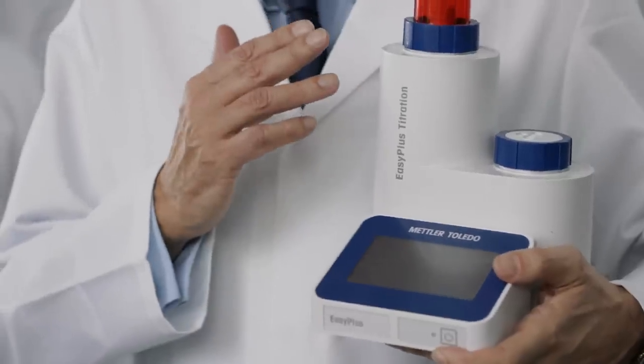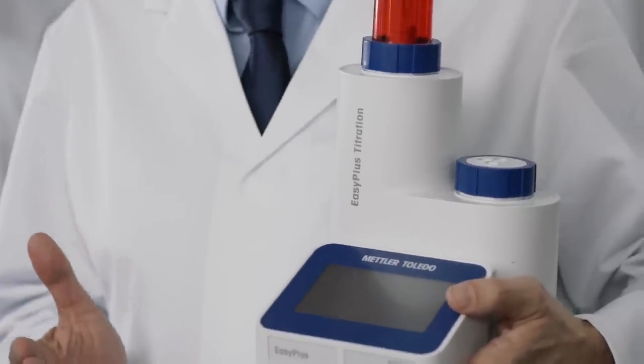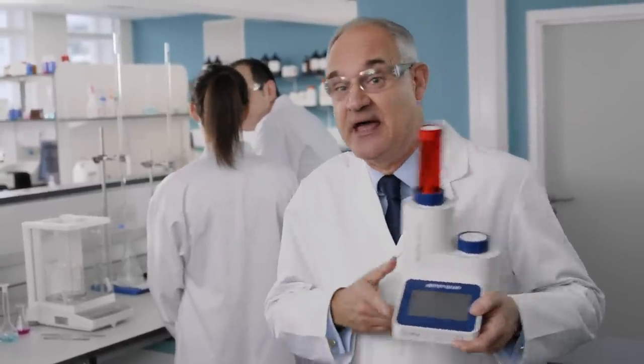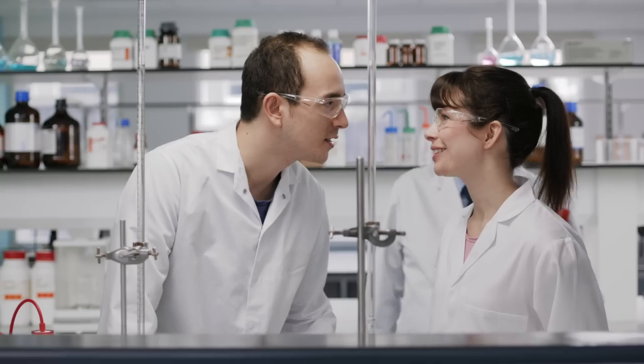Increased precision with the automated burette and immersed dispensing tip. No more calculation errors with the built-in software. Avoiding over-titration and operator-dependent color interpretation.